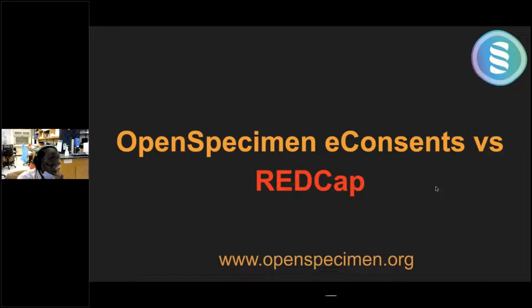One of the first things that I want to address, because Redcap is popularly used across the board, especially in American universities, and many of them use it for e-consenting. The most common question that we get asked is, why use OpenSpecimen's e-consenting when we could just use Redcap?